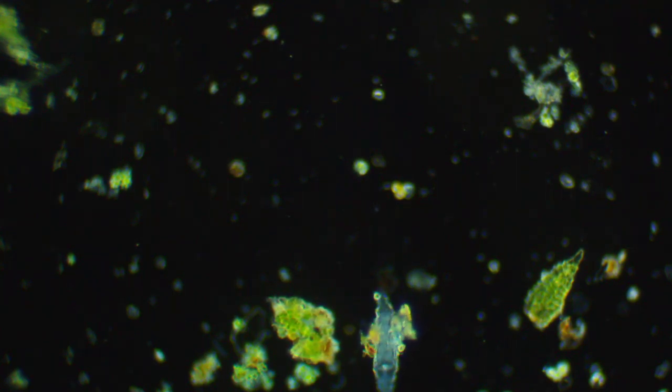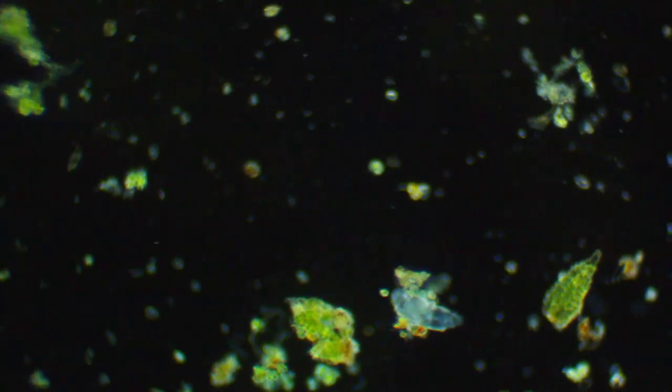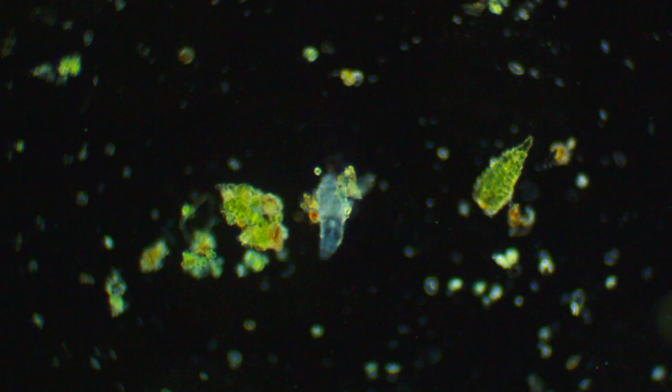The problem is if you put the rotifer on the button, nothing would happen. He does not weigh enough to do anything.